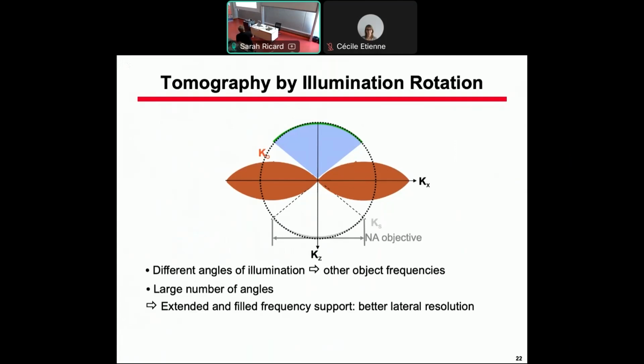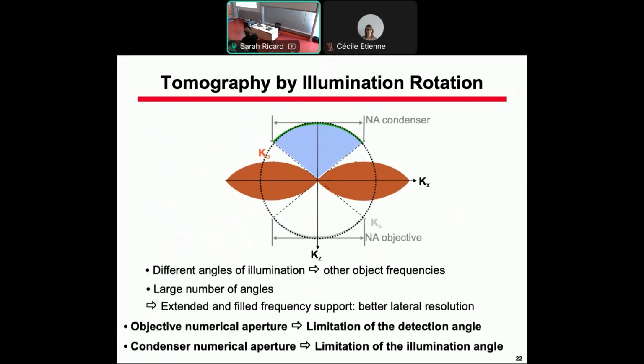Meaning that along Z, something not so nice. At detection, we are limited by the object.